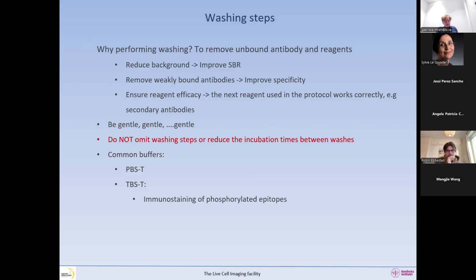You should use TBST as a washing buffer if you perform immunostaining of phosphorylated epitopes, or you perform chromogenic labeling with alkaline phosphatase. So just don't take the first buffer that you find on the bench, or borrow. Think it through: what you are actually doing, what kind of assay you are performing, so you are using the correct one.